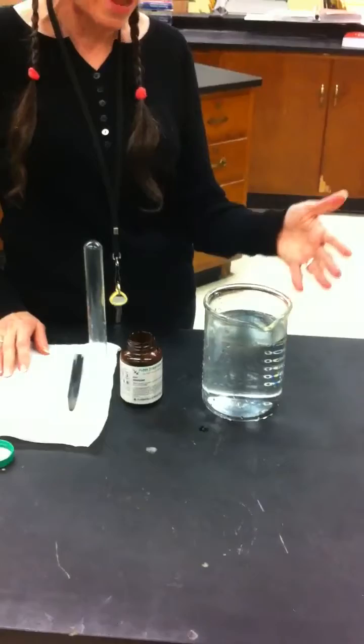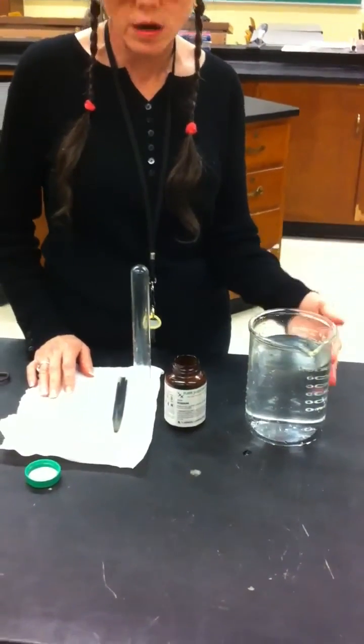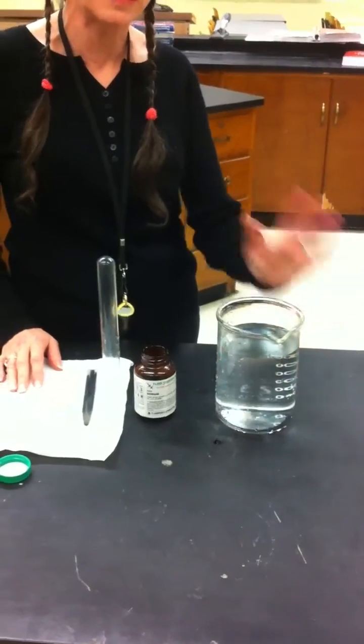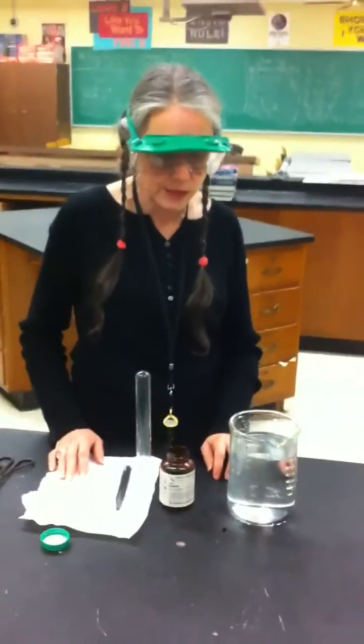If you are wanting to extend this, you could actually put some bromothymol blue in the water, and notice that the water is going to stay blue because sodium hydroxide is one of the products, because the sodium goes in the water. You can also do all kinds of things about how much water to how much sodium, but I didn't do that — I was just excited about seeing that cloud. Thank you.